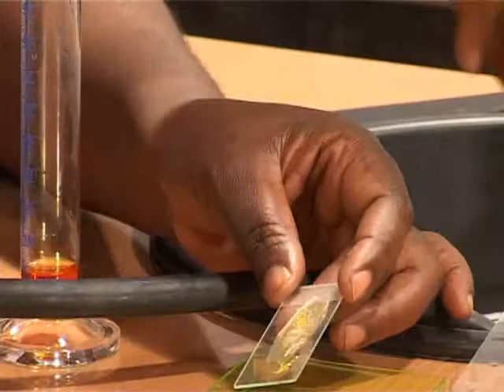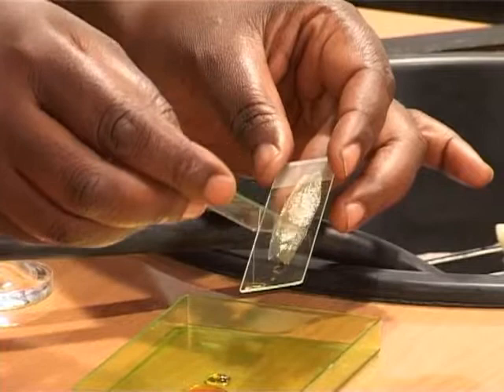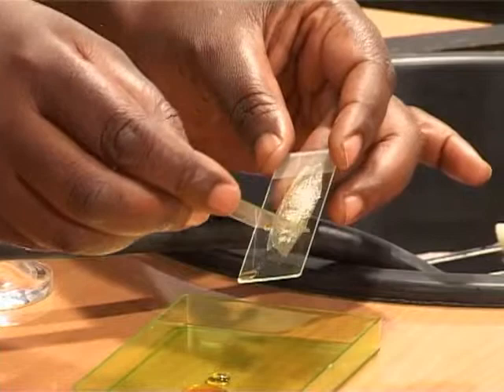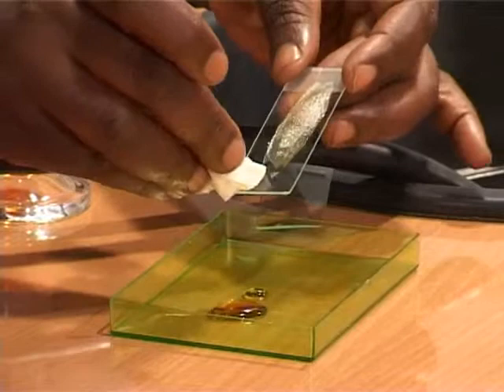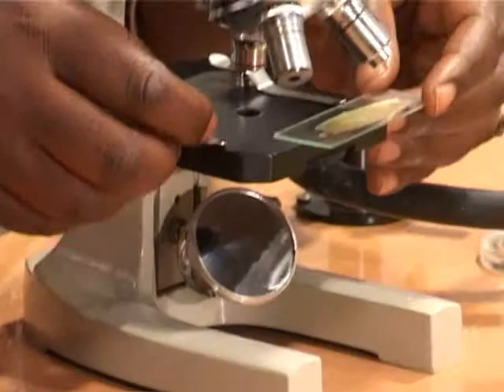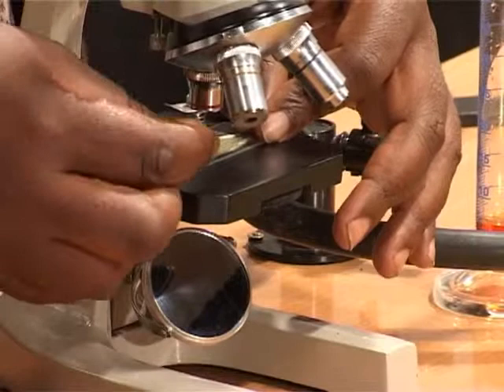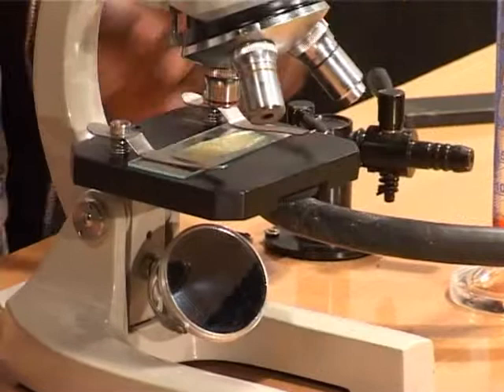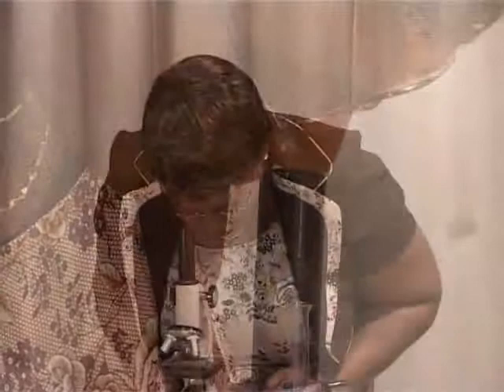Now after you do that, you need to get a glass, you drain the iodine, you have to remove it so that it does not disturb our experiment. You make sure that you drain it, and also the bubbles should be drained. You can use even a cloth or a tissue. You remove all the iodine solution, and then we go and put our specimen on the stage, okay, like that. Okay, let's put our clips back so that they hold our specimen. Then you have to see again. Like that.